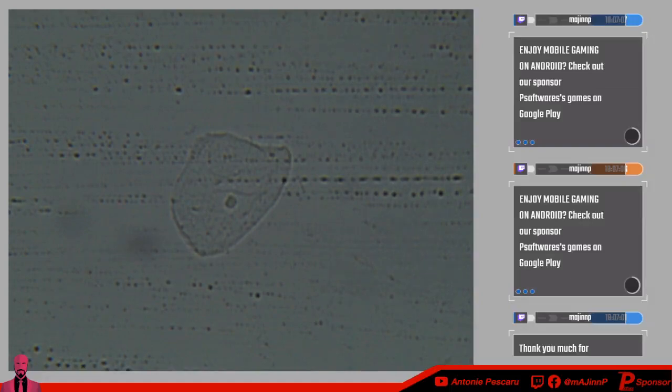You could see movement if you fast forward the camera a little bit. These ones are dead because you can easily pick them up. What happens with cells is that they want to take as much space as possible, but when they die, that's when new ones grow.